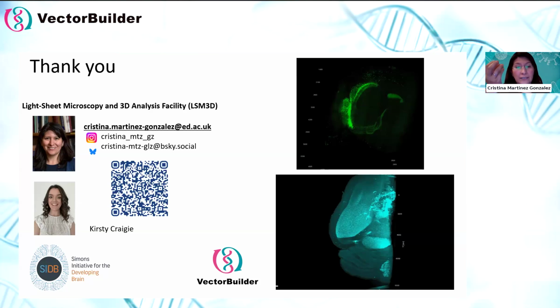So you want an objective that is immersed in the liquid. So the objectives in confocals can only be immersed in water base. There is a very good 20x objectives, water base. They don't necessarily need to be clearing objectives. They could be the normal 20x water dipping objectives. But then for that, ideally, you need to use the water base clearings unless you protect it. I think you can protect it with glass if you go for solvents, but if you have a light sheet, solvents. If you don't have a light sheet, water based and a confocal.